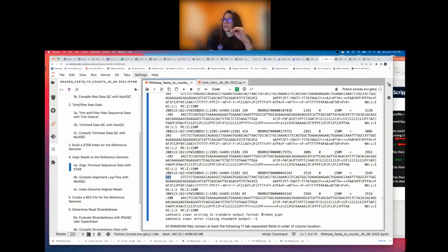And then if you look at the one below that, it has the same cluster location or address as the one above it. So again, working on the same template or insert, however you want to think about it. And same template length, except this time in the negative direction. So this is now the third time that we're seeing this read, which is the opposite orientation of the one above it, acting on that same template.